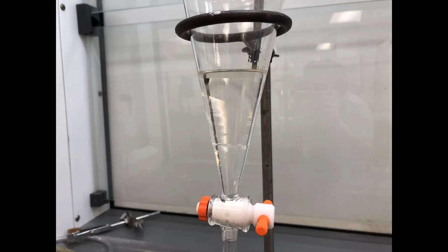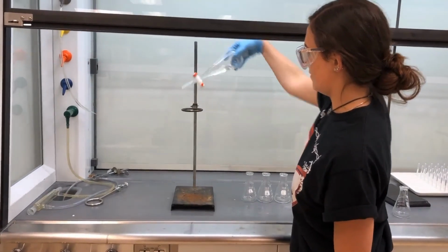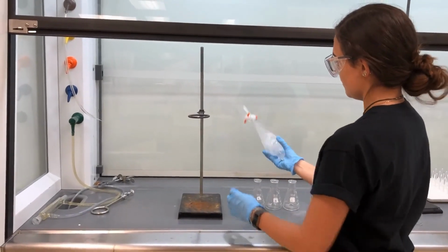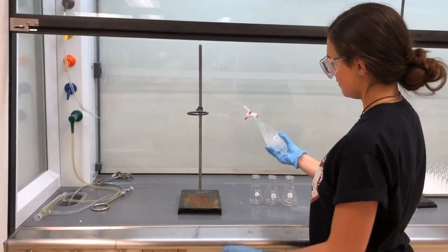You will need to invert the separatory funnel. This means that you must release the pressure inside the separatory funnel when the reaction is occurring. Releasing the pressure is also known as venting. To do this, you want to make sure that the cap of the separatory funnel is at the palm of your hand and that the valve at the bottom is closed. You then invert or shake the separatory funnel like this a couple of times. To release the pressure, you must make sure that the nose of the separatory funnel is facing away from you and is inside the hood.